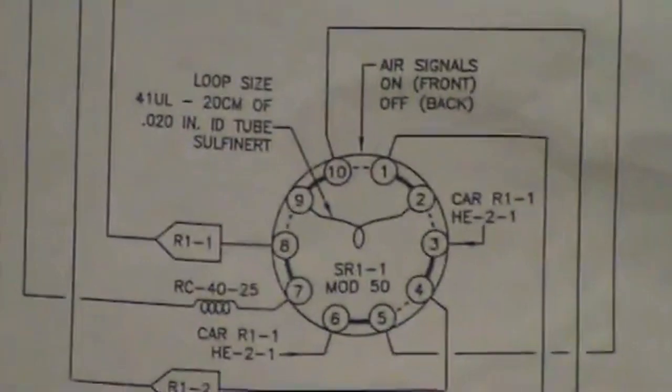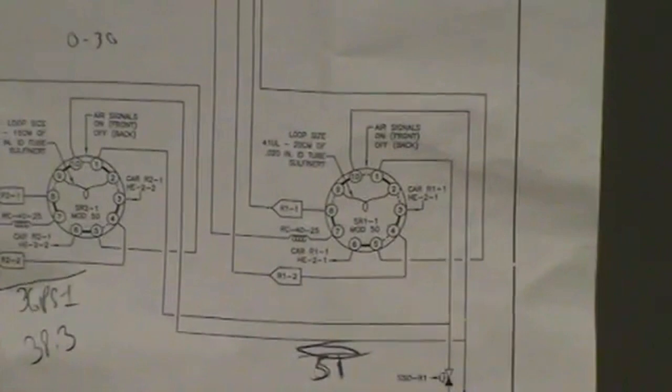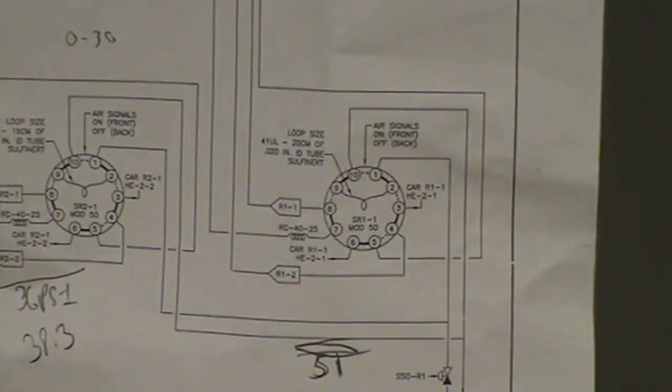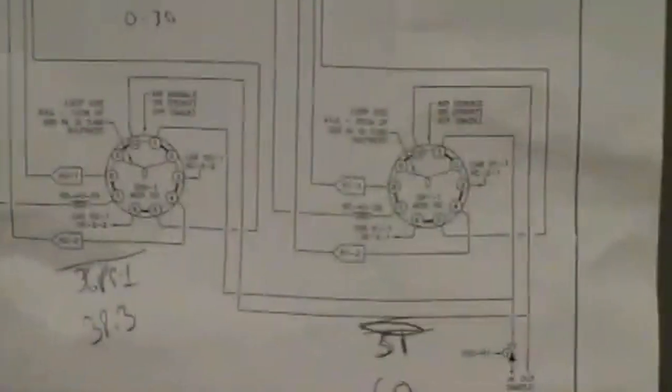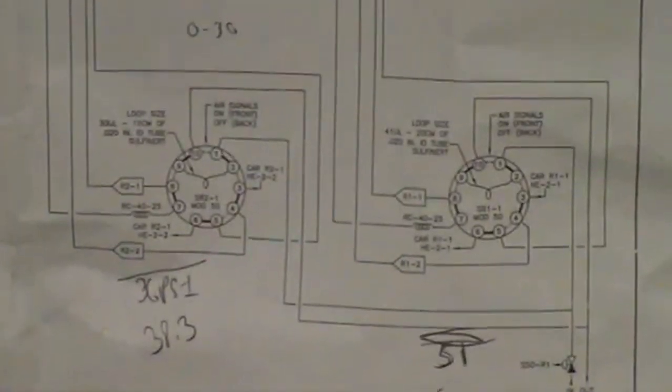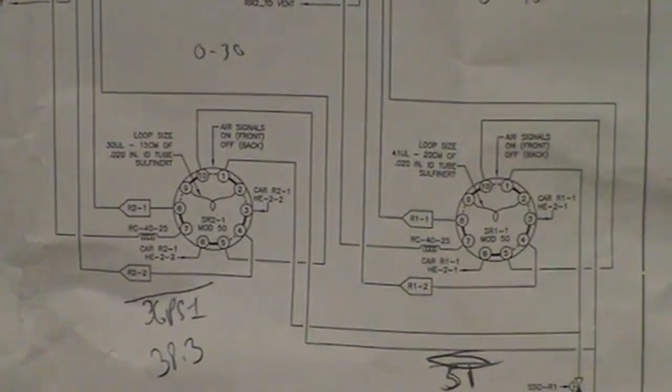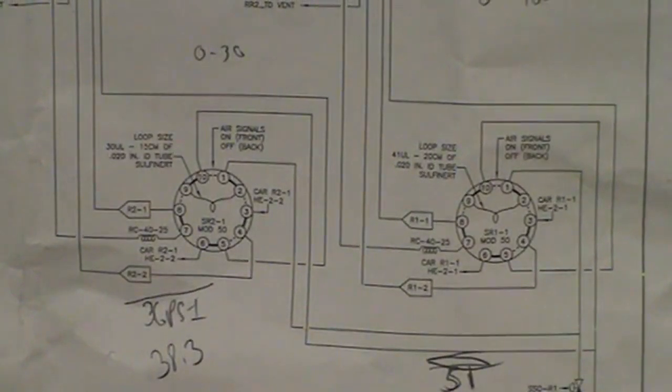And let's concentrate on just that one right there. So, bringing our sample in, it's going to T, then it's going to come in on 1, come in on 1, so it's coming in on 1 on both of them. Come in on 1 internally because the valve is in the off position. On the off position, we go through these solid lines.